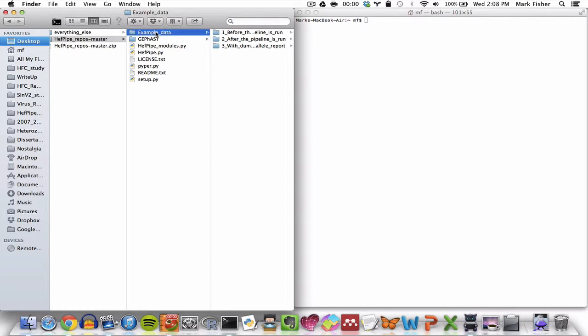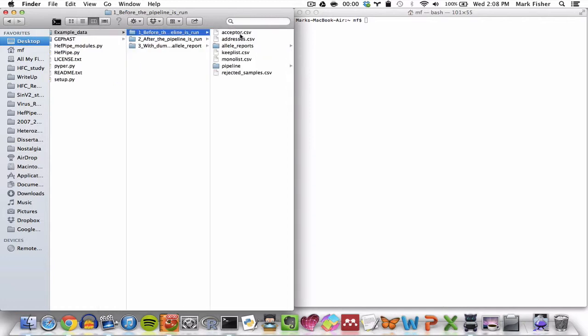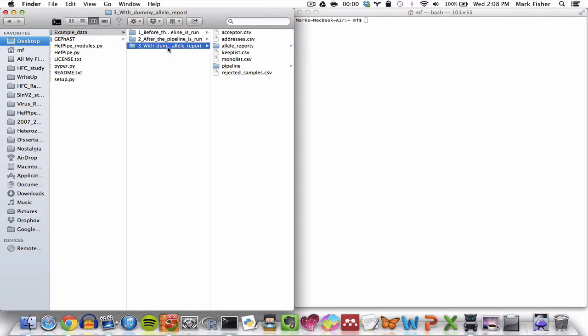In it, we'll find three subdirectories. This one, before the pipeline is run. This one, after the pipeline is run. And this one called with dummy allele report.